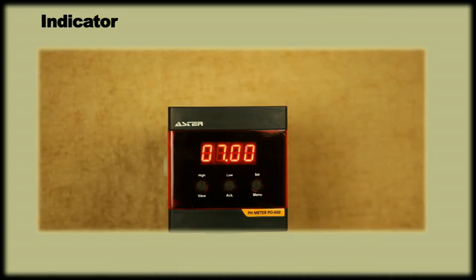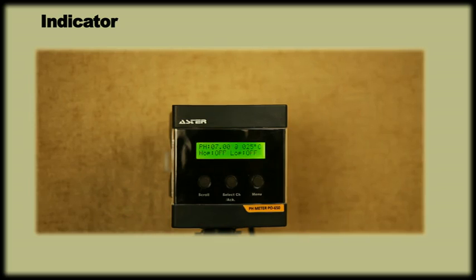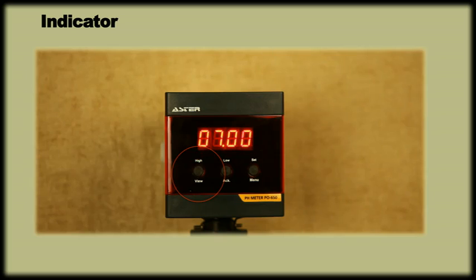Indicator: The indicator has a LED display. We also offer meters with dual-line backlit display to simultaneously show temperature and pH. Our standard meter is supplied with high and low relay outputs. It gives signal to dosing pumps, hooters and valves.